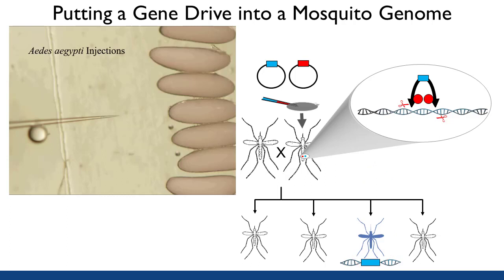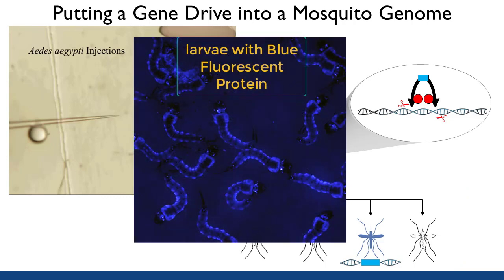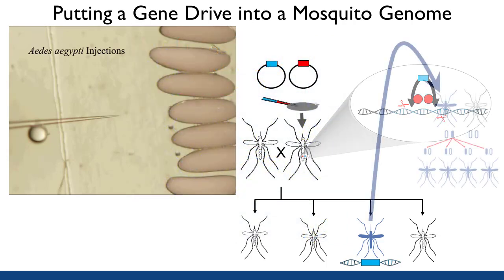The technology for creating transgenic insects is not 100% efficient. So only a fraction of the progeny arising from that insect that had been injected as an embryo will be transgenic. Typically, a gene conferring a visible phenotype is included in the package of transgenes so that identifying those initial transgenic insects is easier. Often a gene encoding a protein that fluoresces under some conditions is used, making the identification of a transgenic mosquito easy, even at the larval stages.